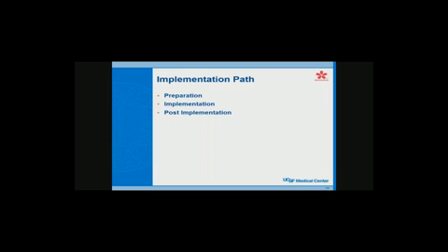So this is kind of just an outlined implementation path. The first part is preparation, second is implementation, and third is post-implementation. And the preparation part is the longest. We were talking about years sometimes. We spent probably 2 years preparing for this, looking at systems and things, and then implementation is probably anywhere from 4 to 6 months. And then post-implementation will be 2 to 3 months cleaning up issues afterwards. So we're going to go through each of these types of things. I'll give you a little bit more detail.